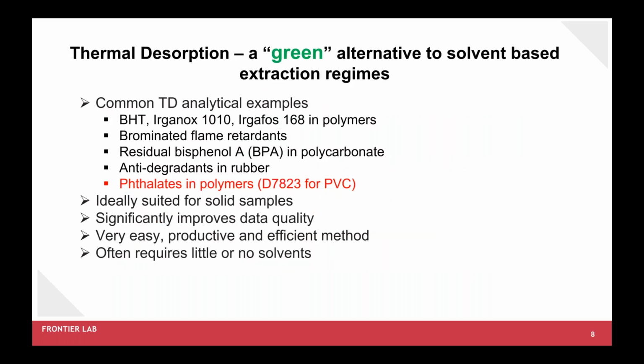As we just mentioned, the traditional techniques require a large amount of solvent, excessive analysis time, and can be prone to contamination and other errors. The result of this additional sample handling can reduce laboratory productivity, and the information obtained could exhibit poor precision and accuracy in most cases. That's really where thermal desorption GCMS comes into place as a green alternative to solvent-based extraction techniques. Thermal desorption GCMS is ideal for any type of solid samples.